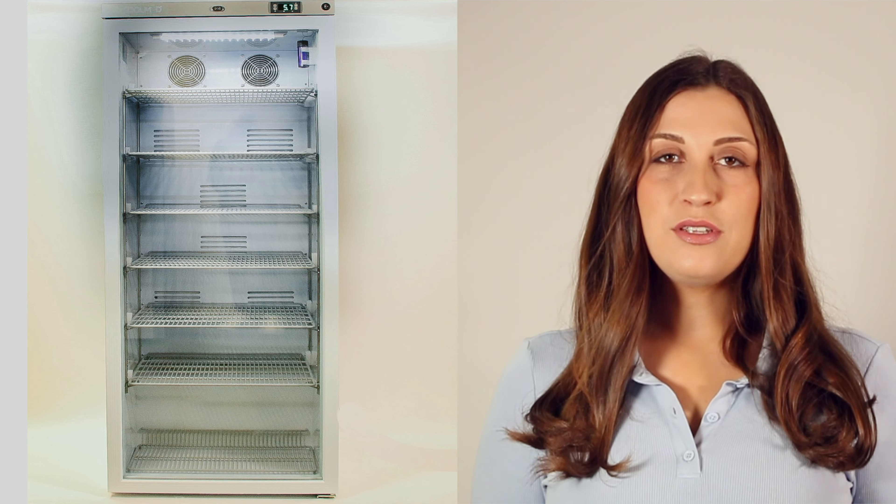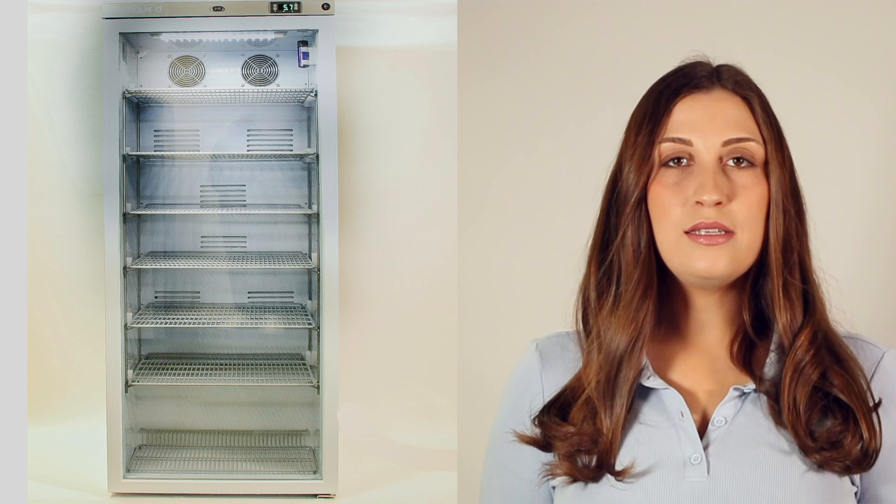Our CMG400 is a 400 litre capacity large medical fridge. This fridge is ideal for storing larger amounts of medical products such as medicines and vaccines.